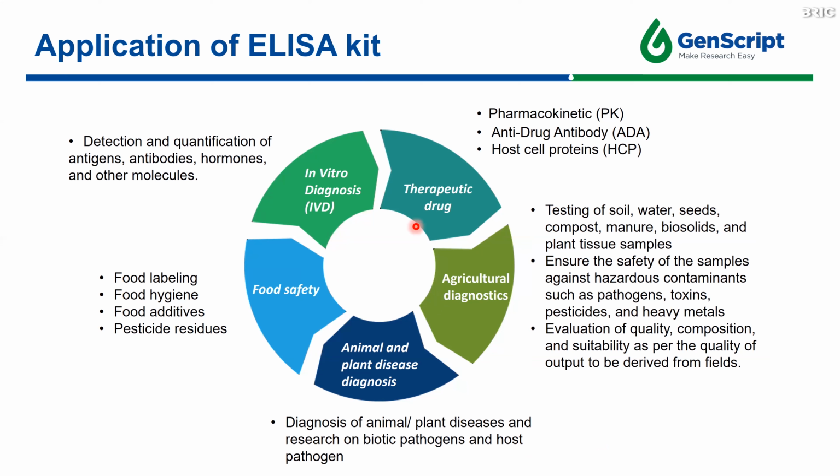In the therapeutic drug development area, it is used to examine drug absorption, distribution, metabolism, excretion, and immune response after drug administration, and checking the host cell protein in the drug development process is also very important.